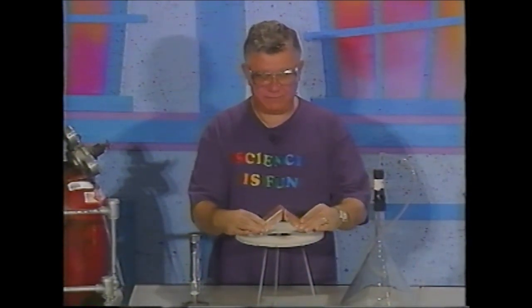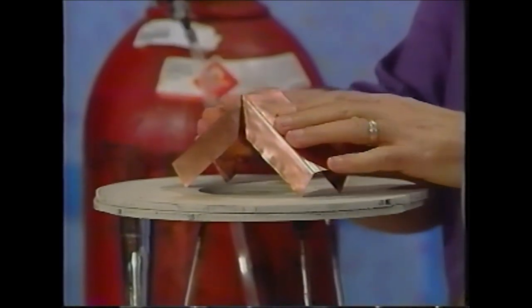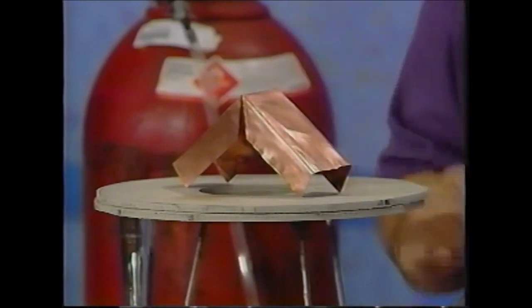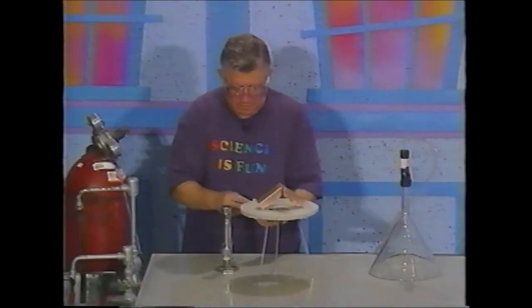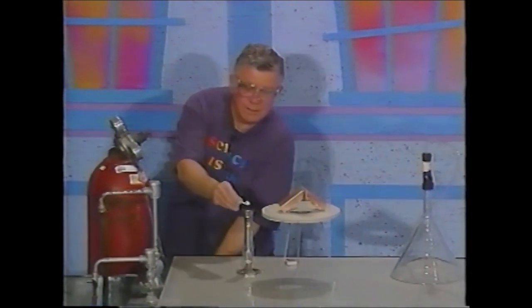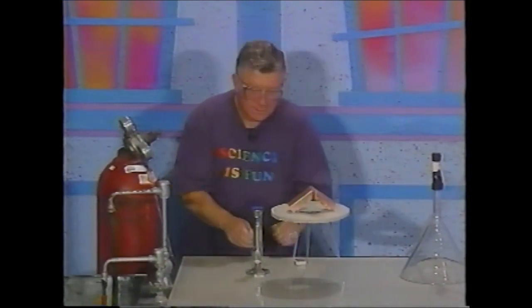At this time, I'd like to do an experiment using a metal that everyone knows about. It's called copper. I have a piece of copper in the shape that you see right in front of me. What I'm going to do, you see it is shiny, and what I'm going to do is heat it. I'm going to use a burner to heat it, so I'm going to turn the gas on, and there, get the burner going.